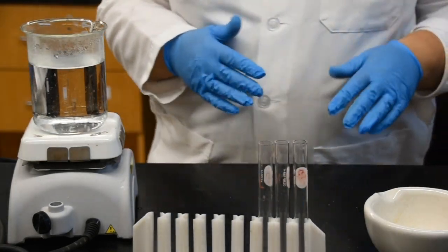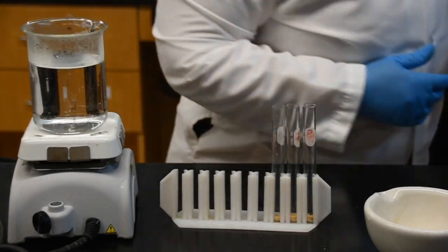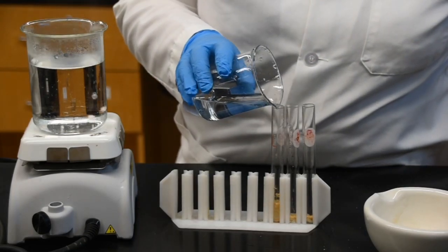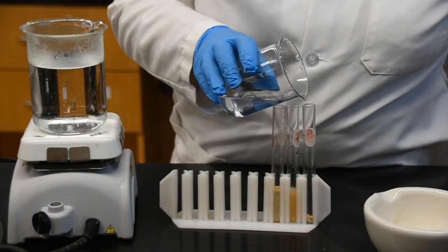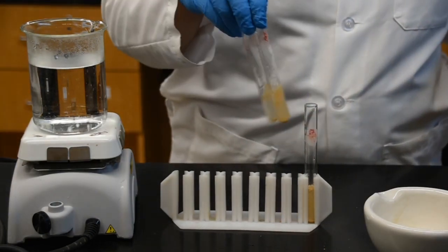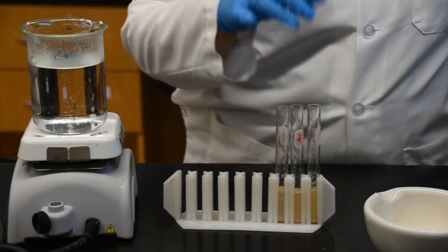Now, before I add my solutions, I do need to add a little bit of water. The water is not essential, guys. It's just for something to wet your sample and make it easier for you to mix your sample with your solution. So again, the amount of water is not as essential for you to know. So here I'm going to mix my sample, make sure that it's properly mixed.